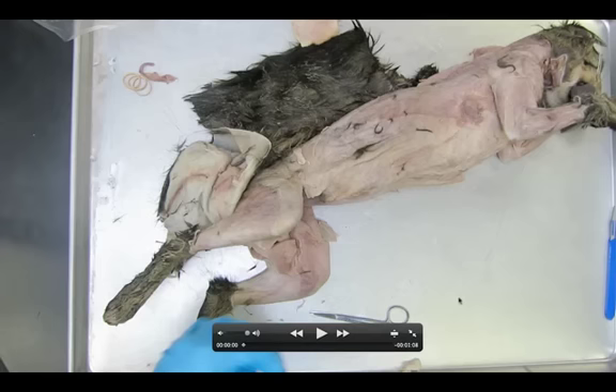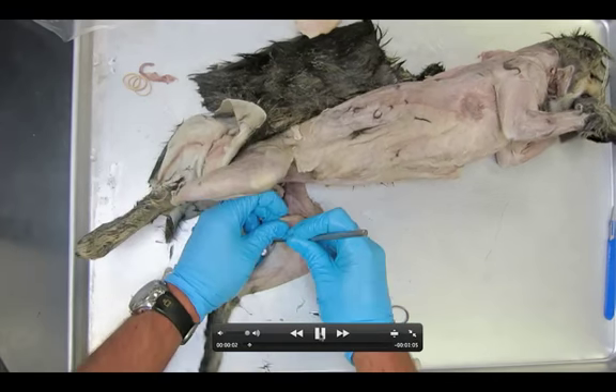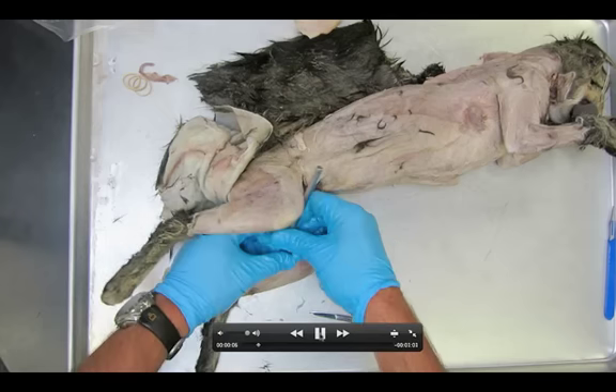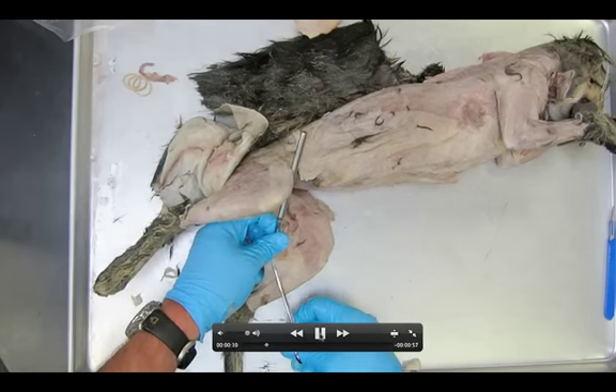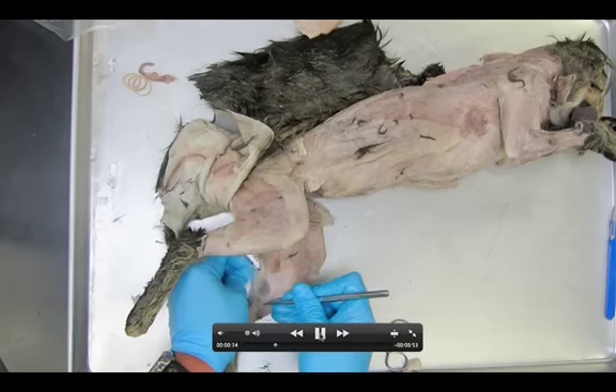This is dissection 14, the medial lower leg muscles of our cat. You're noticing again we are on the medial surface. A pretty common mistake is that people accidentally think this is the lateral surface of the leg, but we are on the inside.